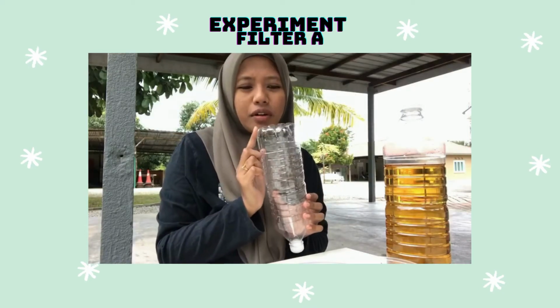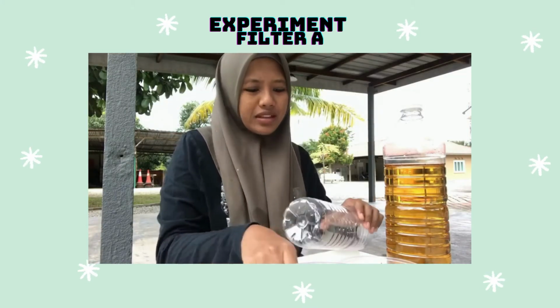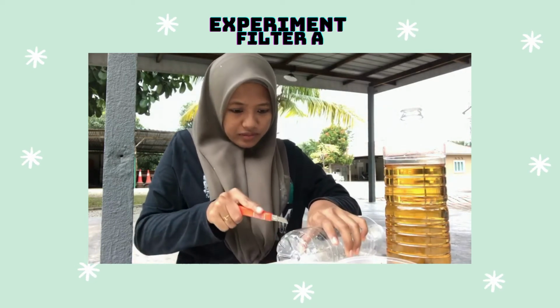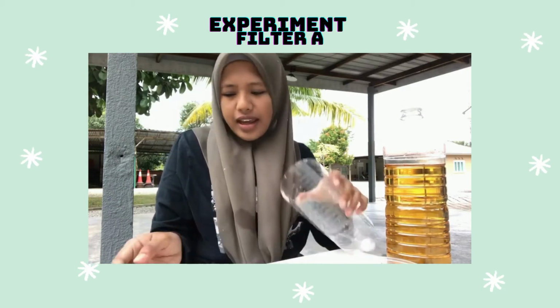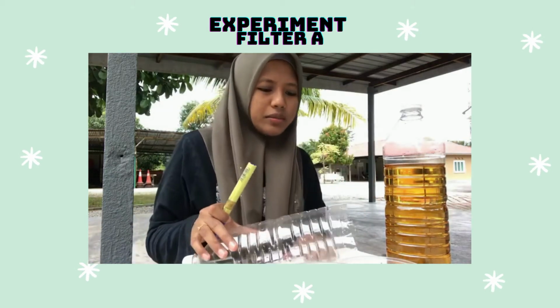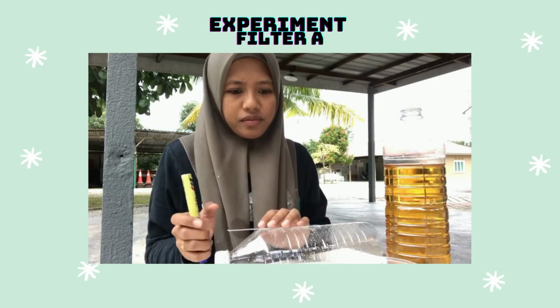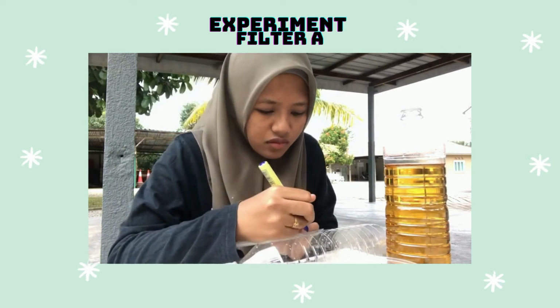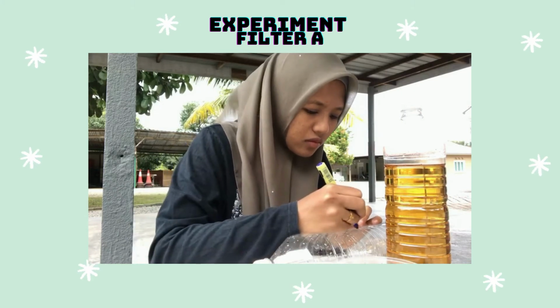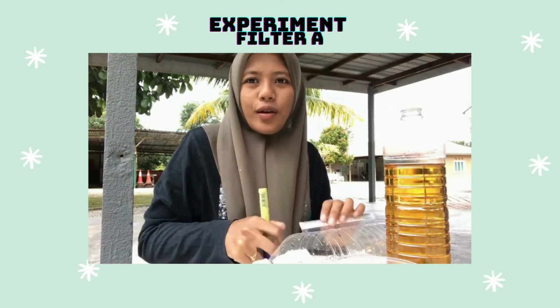First, cut the top of the bottle around 1 cm. Next, mark the bottle for every single item. Okay, done. Next step, we put a cotton pad in the bottle.